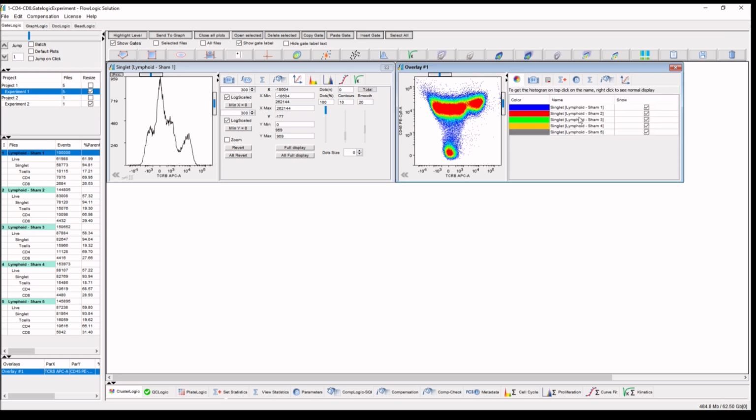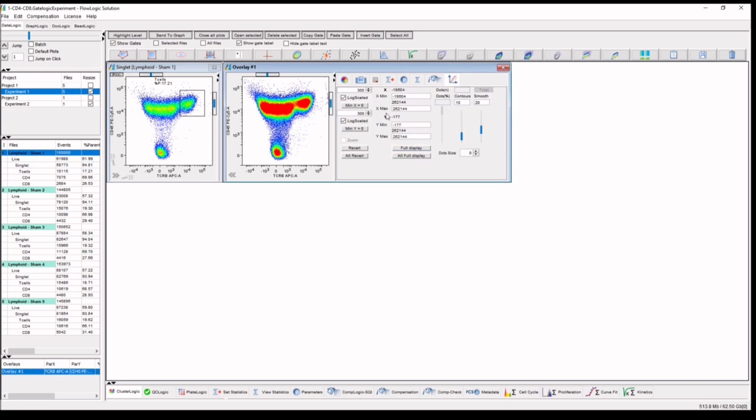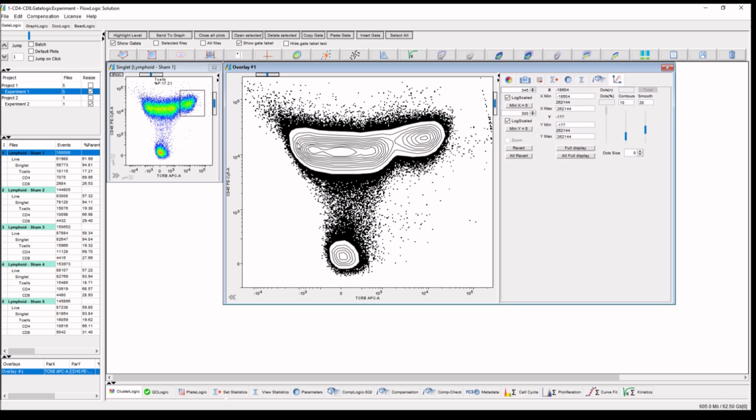This is the result of these 5 all together. So if we go back here, not just this, what we can do here, we can compress the data in a different way. It's very flexible, the compression. And we can even change the display. So for example, if we want the data displayed as a contour, we display the contour. We improve heavily the quality of our contour. As you can see, quality now is excellent.